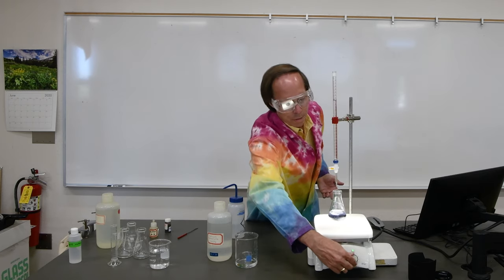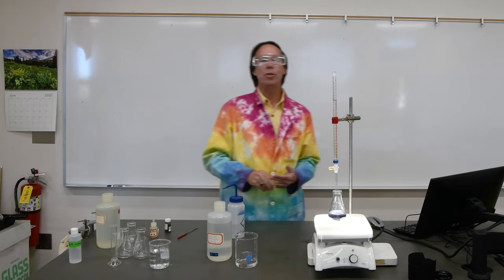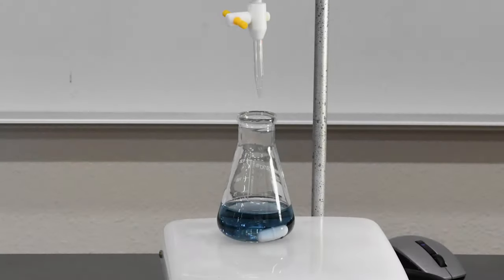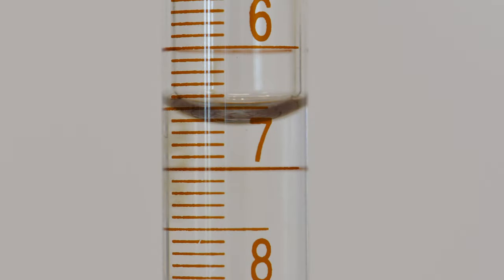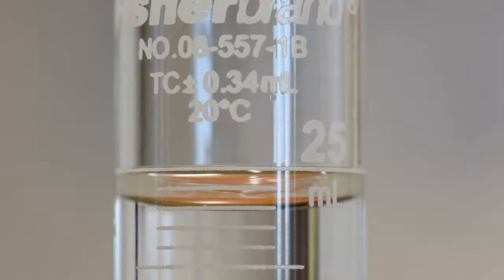So now we can turn off the stirrer and we'll simply take a reading of our burette and we can determine how much EDTA was required. Here's a close-up view of the blue color we get at the end of the titration. And this is our final burette reading after the first titration. This will also be our initial burette reading for the second titration. This is the volume of our standard calcium carbonate solution for the second titration.